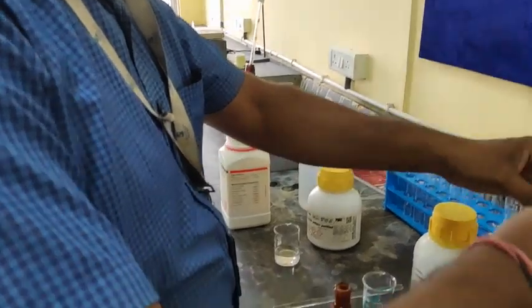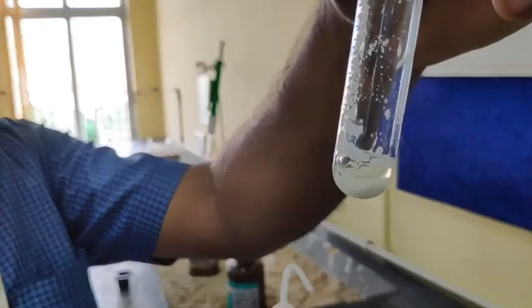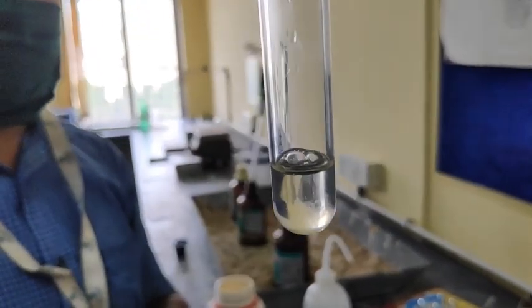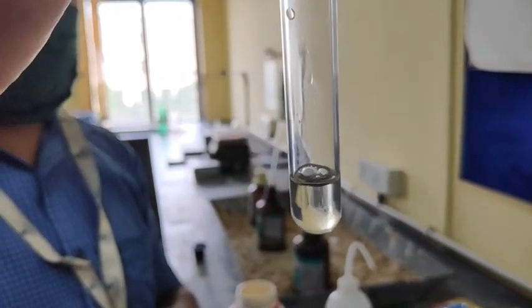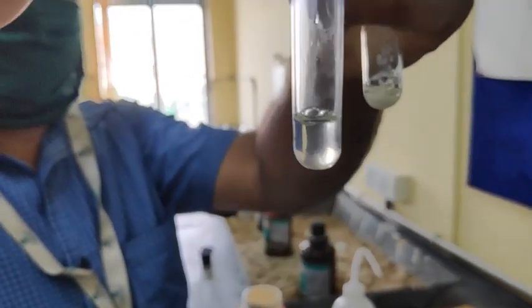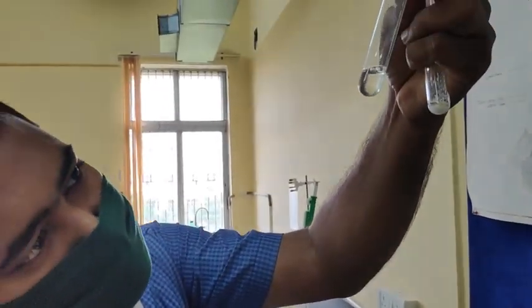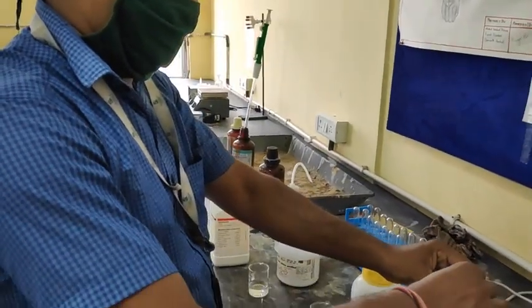So if we check the full saturation test, we can see that some precipitation has occurred, but in case of the half saturation test, though no precipitation has occurred, there is a slight change in the concentration. As we can see, it is now a little bit cloudy. So we can say that this test has been confirmed.